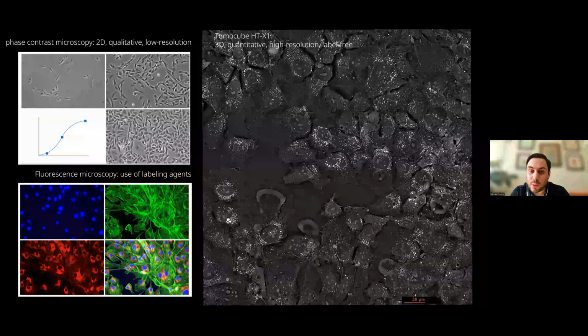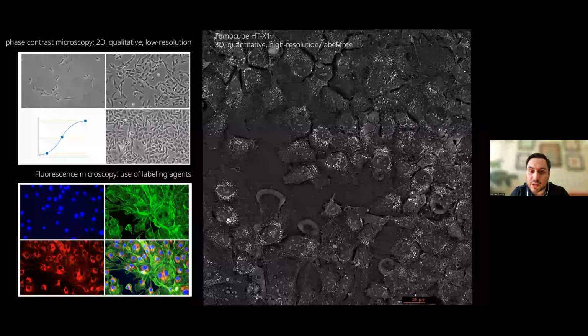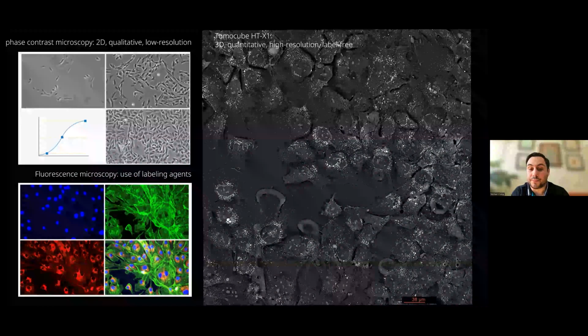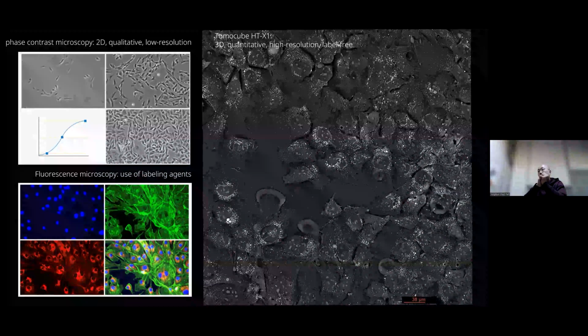One more question about the segmentation methods being developed. Can these also be applied to phase contrast X-ray micro CT images of tissue, as a single channel image data of a similar type? I think in principle it may work, even though we haven't tried.